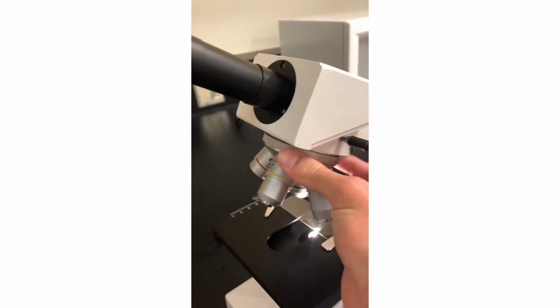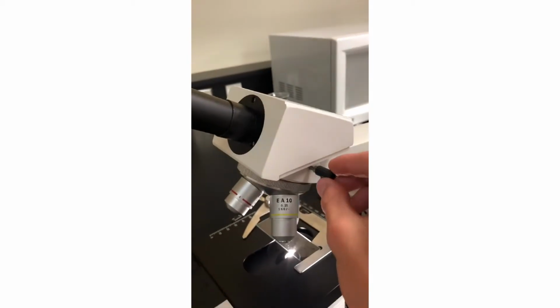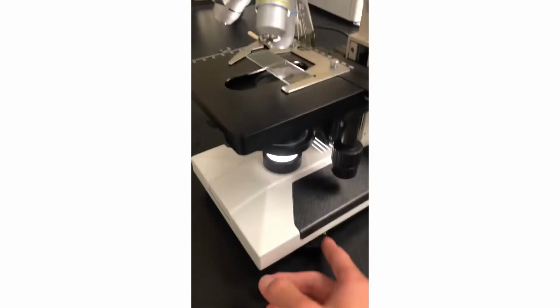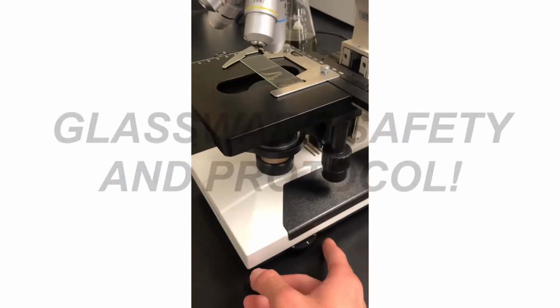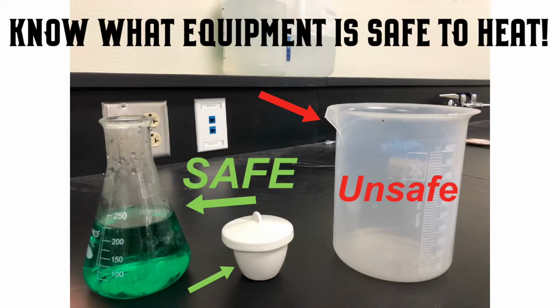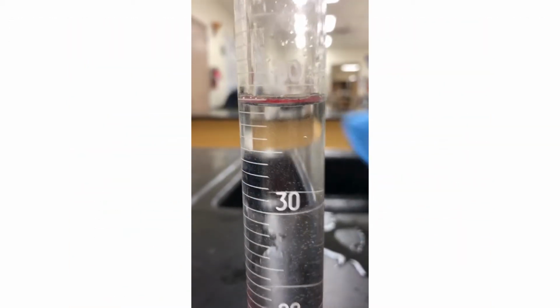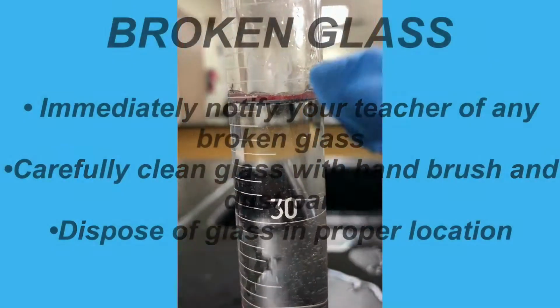Go from here and slide. To change focus, back and forth on here. To change the amount of light, slide back and forth on here. Reading liquid glassware measurements, always go from the bottom of the meniscus, right about there, not the sides.